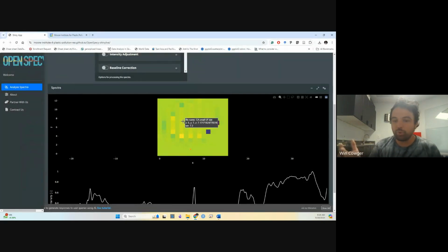There's a bunch of different approaches to analyzing these hyperspectral images. Some people wouldn't even add on this step of identifying where the particles are, but I find it really useful for our workflow. So SIMPLE, for example, doesn't do this step. SIMPLE will just go through and run a correlation to every pixel and then use that information combined with some signal information to figure out where particles are.